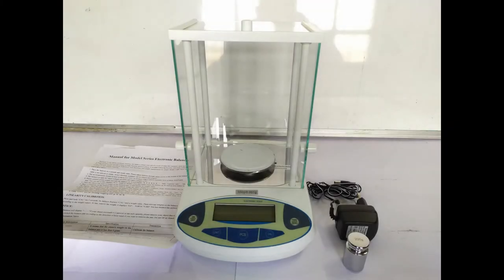So this is the unboxing of my new digital weighing scale from AtomScales.in. We now come to the second part of this video which is a first hand review and use experience of this weighing machine.